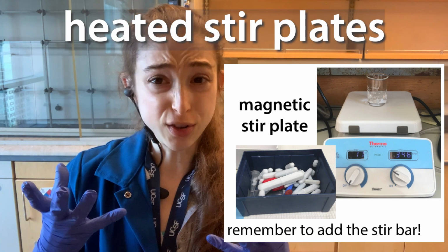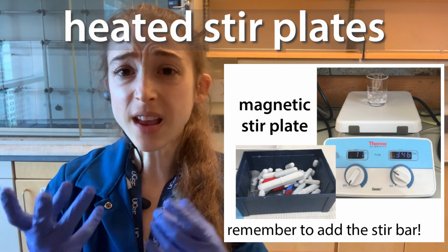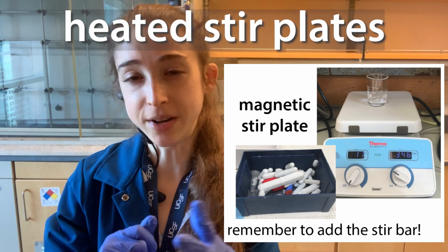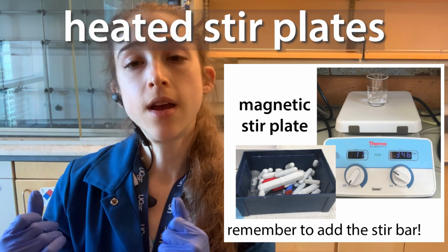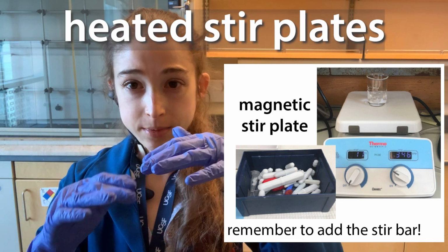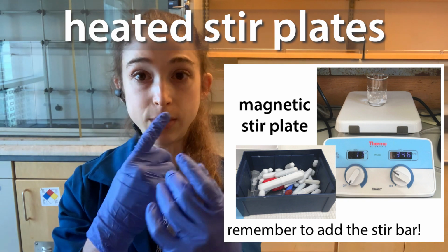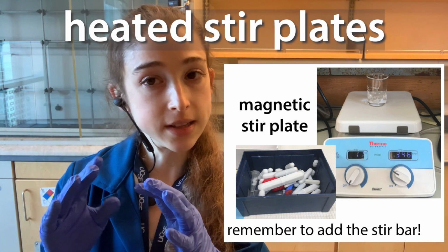This is really good if you're trying to dissolve something that doesn't really want to dissolve, or if you're trying to do some sort of chemistry reaction where you need to keep things stirring at a constant temperature. It's harder to actually determine the temperature because your temperature is on the plate, and then you have your liquid, which is going to have a slightly different temperature. But anyway, it's good for heating things up.